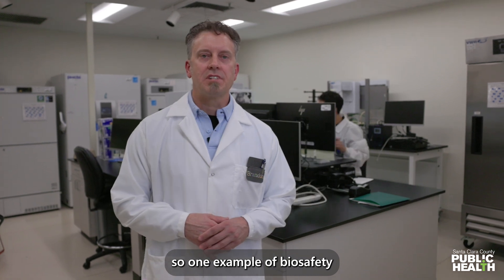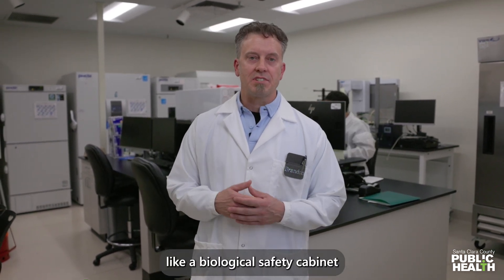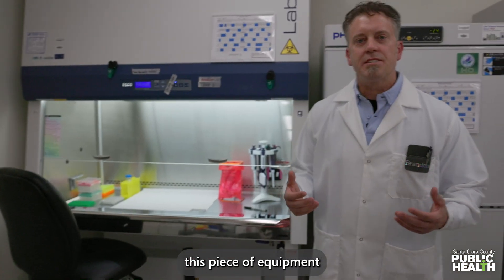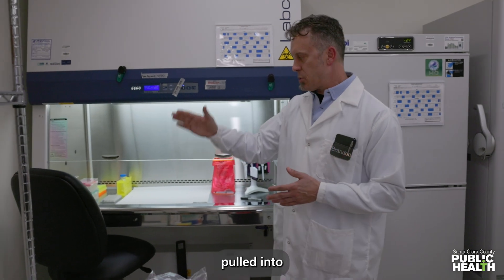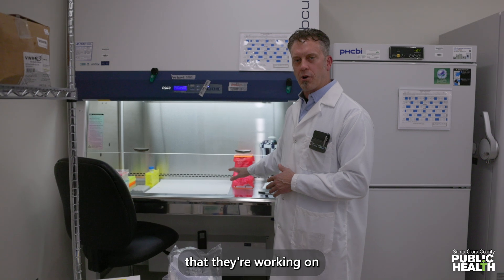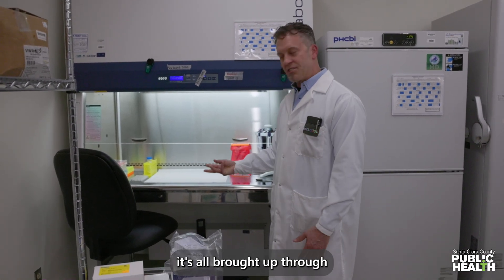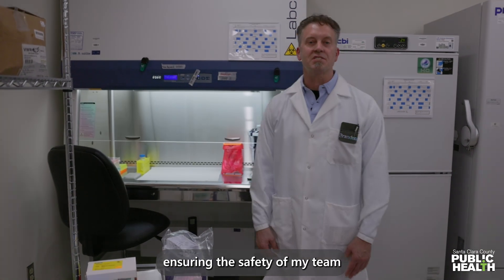One example of biosafety precautions is the use of engineering controls like a biological safety cabinet, like the one we have here. This piece of equipment ensures respiratory precautions for my team. Air is pulled into the biological safety cabinet, so any type of sample they're working on — they don't have to worry about breathing any type of infectious organisms. It's all brought up through and filtered through multiple HEPA filters, ensuring the safety of my team.